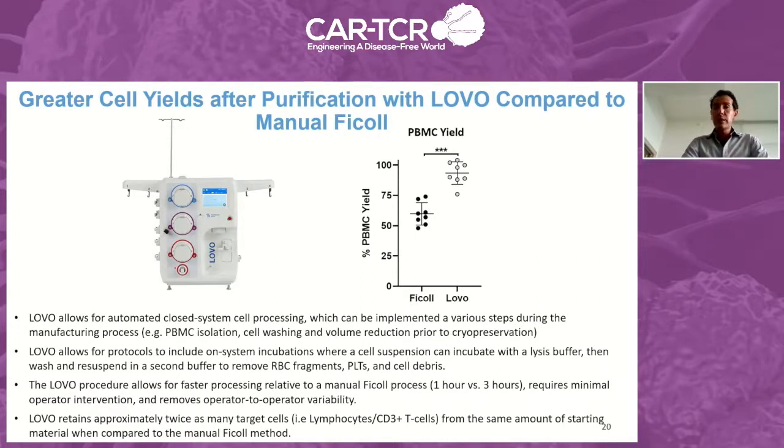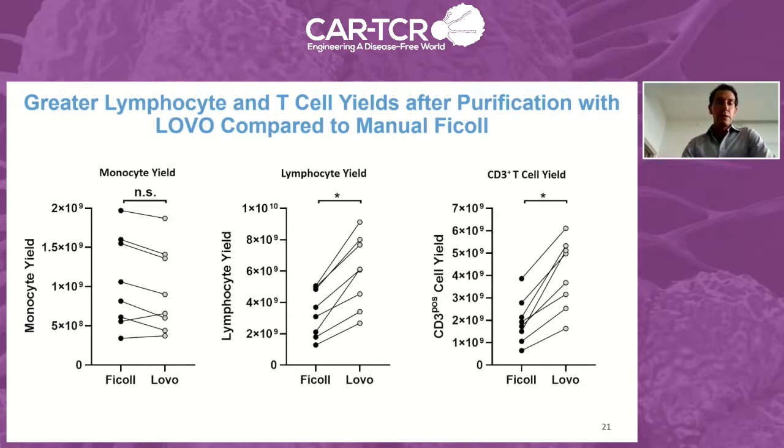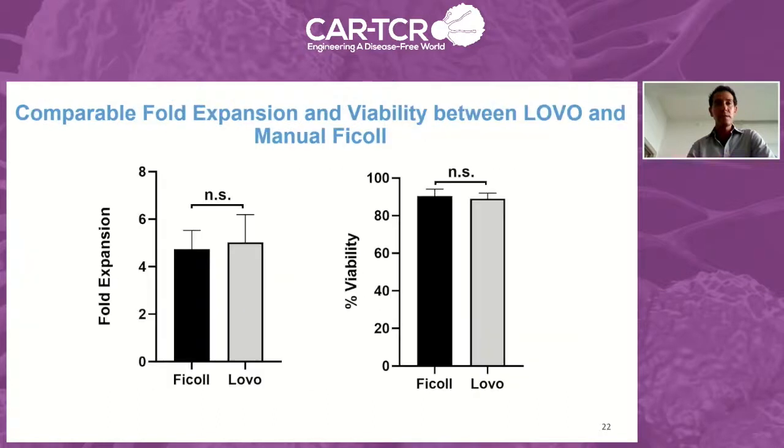In addition to that, you also further simplify the manufacturing process by decreasing the processing time from 3 hours to only 1. And you're now using a process that would enable the manufacture of the cells in a closed system. Using the foundation of a simple and robust manufacturing process, this can now be incorporated to further reduce the number of manipulations in the generation of the cells. This also shows that when you look at the composition of the cellular yield, there is a greater content of lymphocytes, which in our case is beneficial, given those are the cells that we actually want.